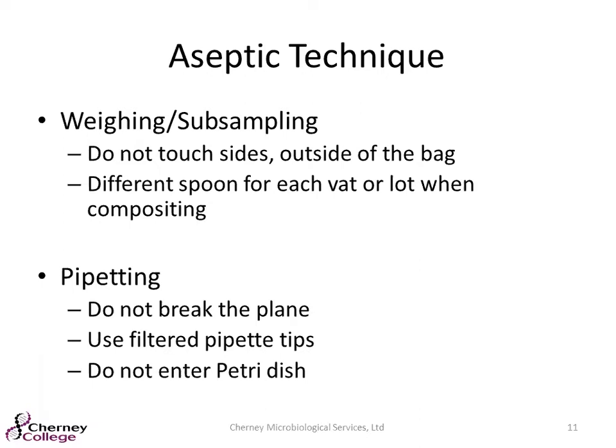When I say do not break the plane, that means when you are inserting your pipette with the tip into a bag or a bottle, make sure that nothing past the pipette tip goes down into that. And if it does, make sure that before and after you sanitize the pipette cone before you go on to the next sample.